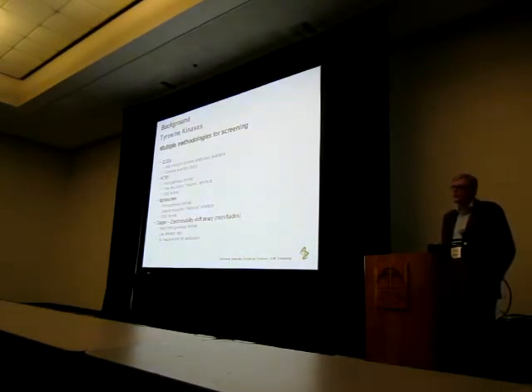Latterly, we've run an awful lot of the Caliper electro mobility shift type assays, the LabChip assays for tyrosine kinases. And again, in our hands, that works very well. That's a semi-homogeneous assay format, so you mix the reagents in a well, and then once the assay is stopped, you then sip the reagents out and do a separation, basically via capillary electrophoresis. So that's great. We don't see too many artifacts using that technology. That works well. People understand it. The separation works very well.